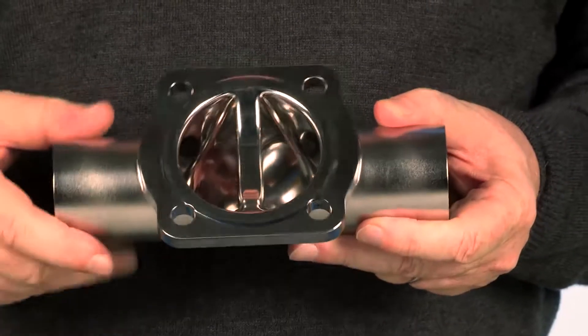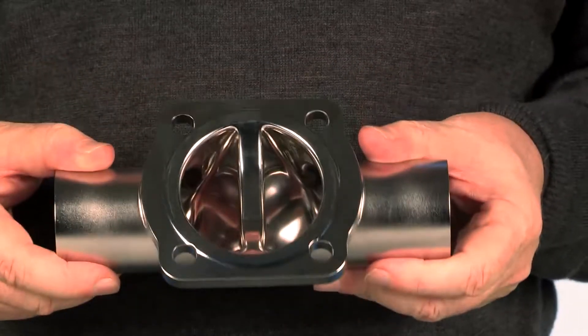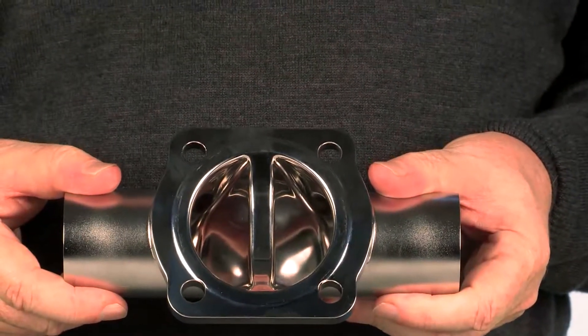Burkitt came up with the tube valve, which is an alternative design. Instead of being manufactured from a large piece of stainless steel, it is manufactured from a single piece of tube, and is a lot lighter and smaller than a conventional hygienic diaphragm valve.